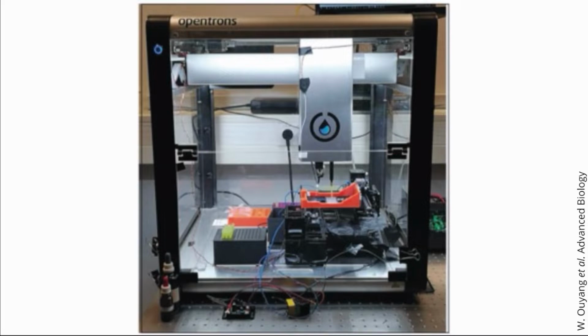The automation that is introduced by the OpenFlexure microscope and many of its related technologies, some of which are our projects, many of which are projects by other people, they enable scientists to take more data that is more consistent. And there's a growing community of scientists using and improving the OpenFlexure microscope for a range of work that my lab couldn't hope to do on its own.